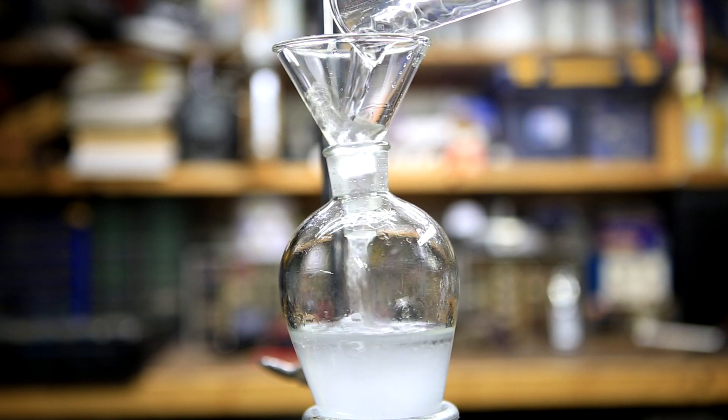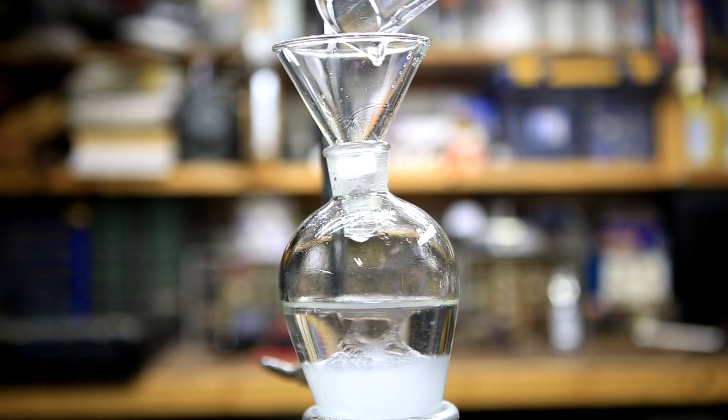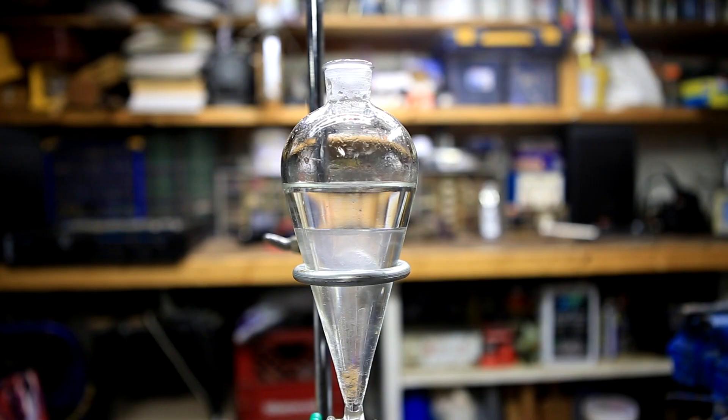This was then washed with 70 ml of saturated sodium chloride solution. If you are lucky, this should more or less break the emulsion, but you should let it sit there for a little bit for the two layers to settle completely.